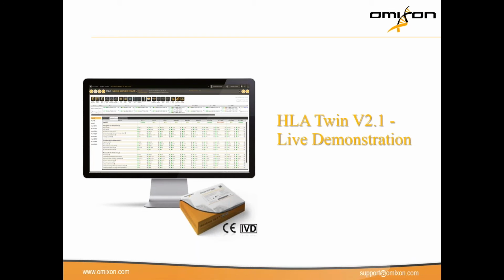So finally, I'll give you some take-home messages. Automating this procedure will free some time. But importantly, samples are traced all through the process. Adaptations are necessary, but I would say they're relatively straightforward. We did this in rather few runs on the Biomek. The fragmentation master mix, and this is a really important part, must be prepared just before use, and volumes can be adjusted relatively to ensure that you have enough within the kit.